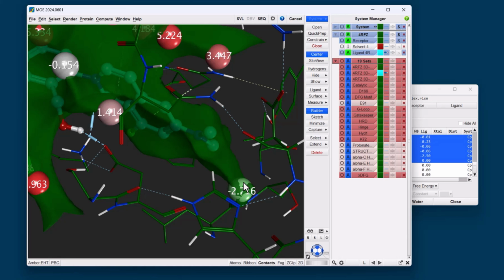There's much more we can do with solvent analysis, but at least I hope today I've shown you some quick, easy analyses that can be done in about 10 minutes.